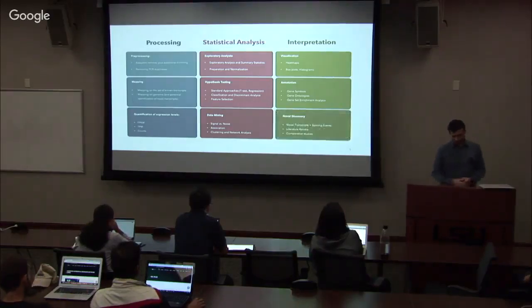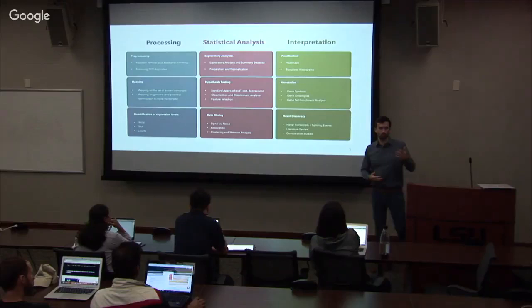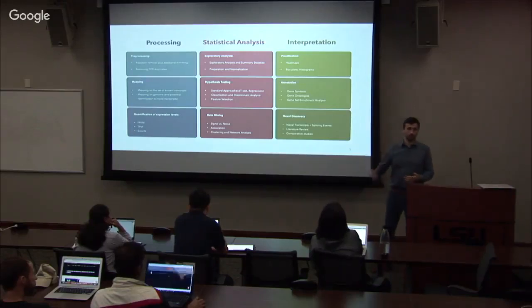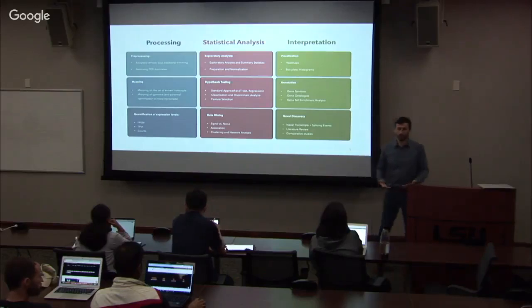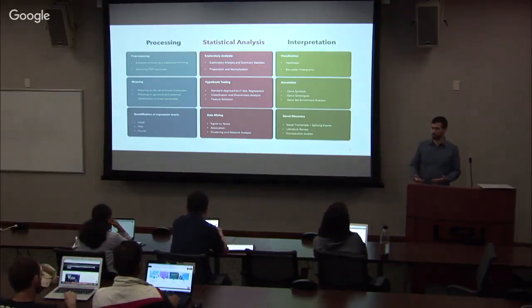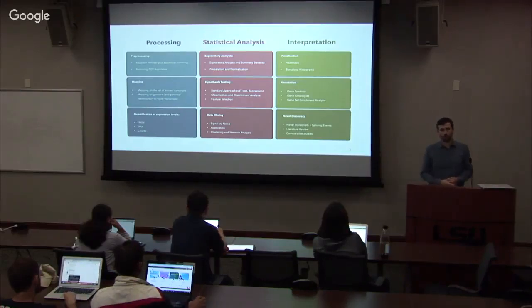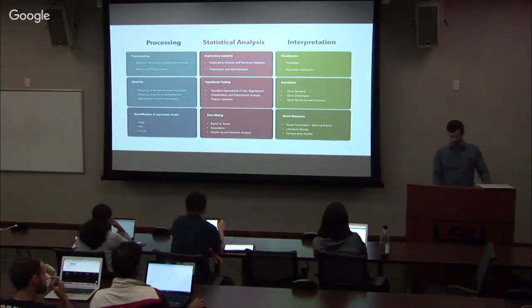And we'll also talk about novel discovery. So sometimes we're not just talking about what did I find from known things, but how do I actually find something completely new? And primarily that will be relevant for non-model organisms or very severe modifications of what is known and is available in databases.